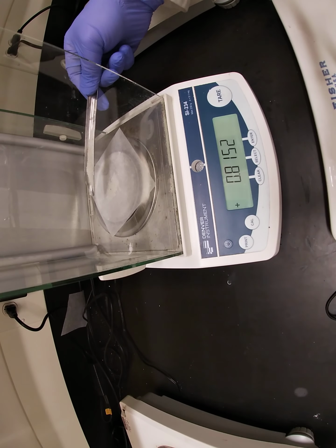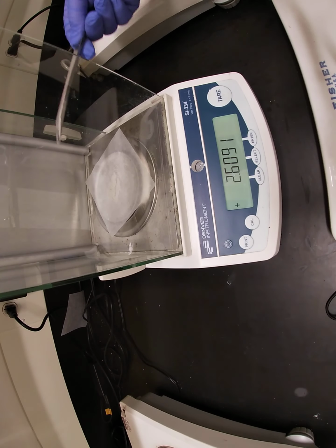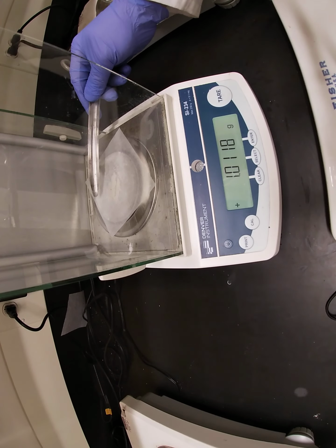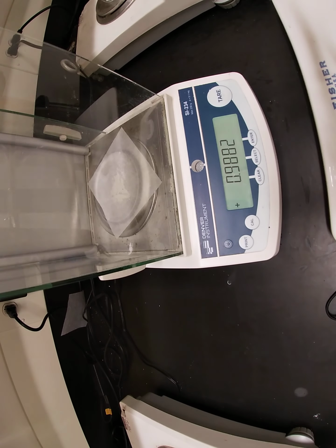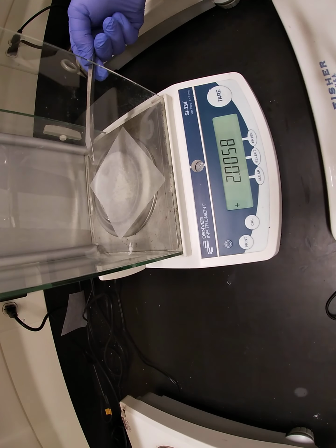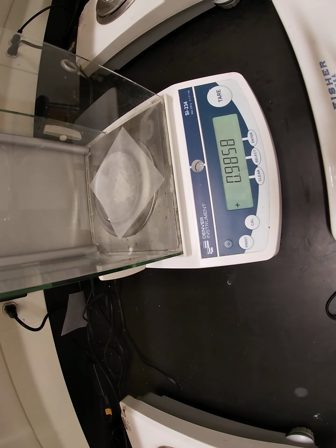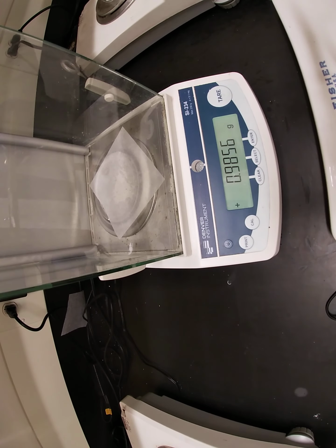And this is silicon dioxide, and you might more recognize this as sand. I'm not going to try scraping any more of that off, and that is going to be our amount there, 0.9856.